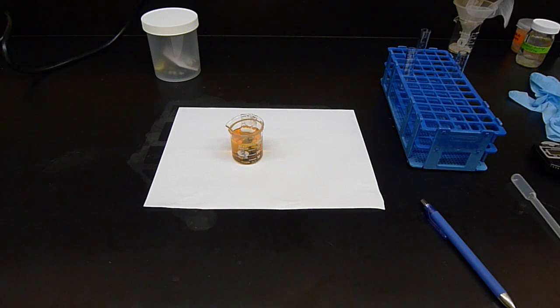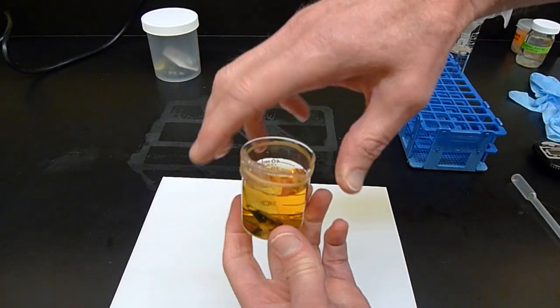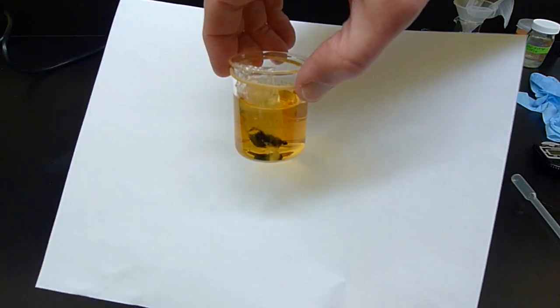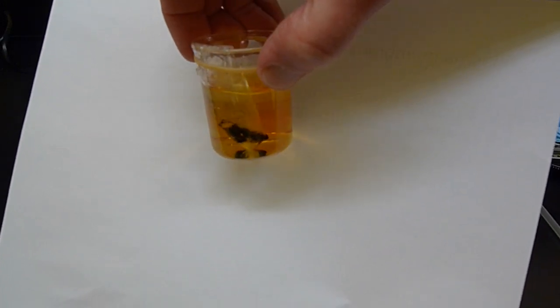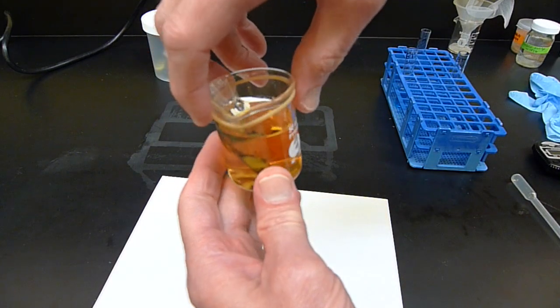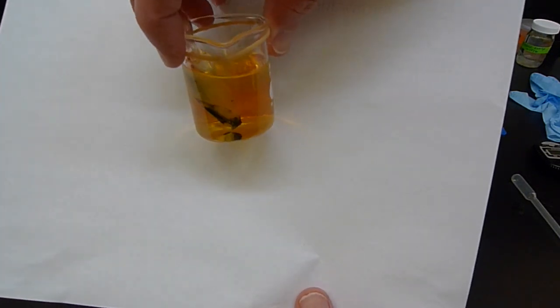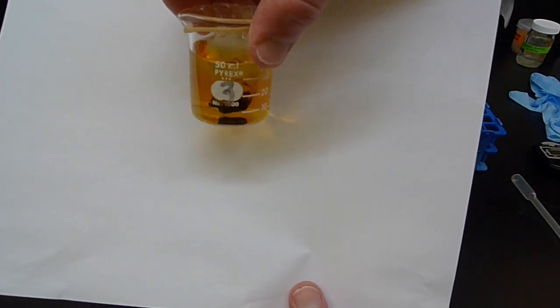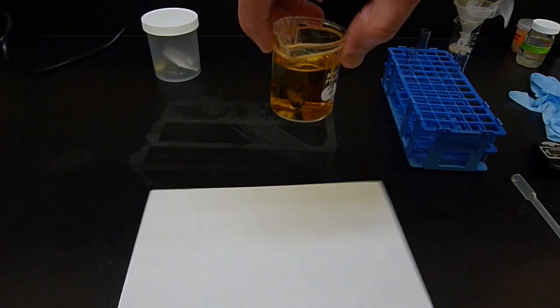So we're back after the bag has been sitting in the beaker for a little over 15 minutes now. So let's take a look to see what it looks like here. I'll give you a close-up. Here is the bag in the beaker. Notice the bag has got a fairly dark color near the bottom there. It's no longer just whitish. And then again, we want to look at the color of the water in the beaker. That still looks relatively uniformly brown. The light brown color again from the iodine. So let's go ahead and record that, and then we'll do a Benedict's test.